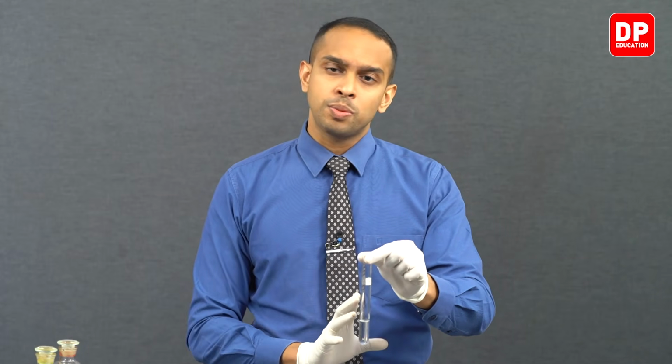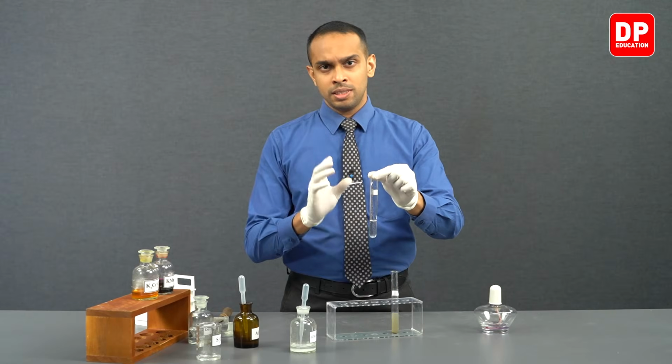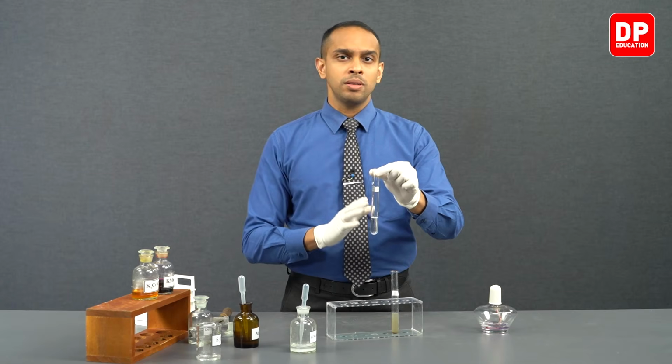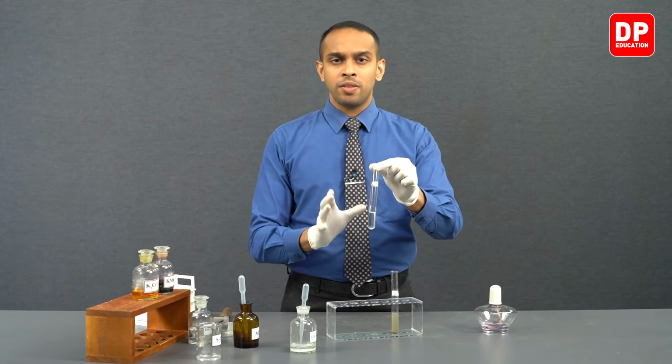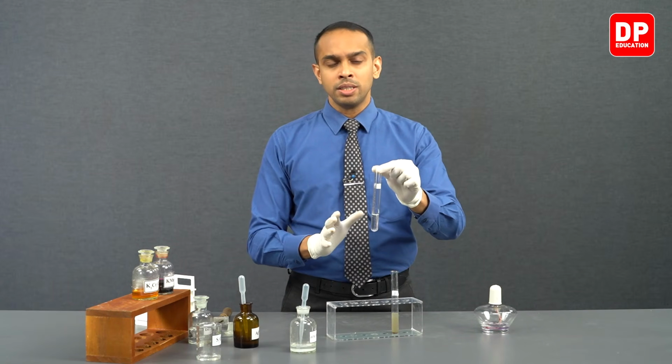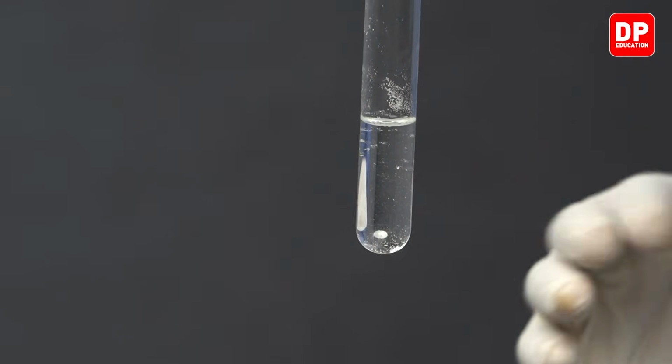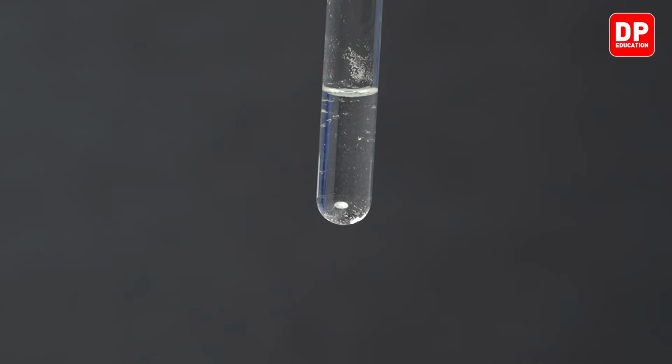However, this precipitate will not immediately turn into a black color. Lead thiosulfate is a stable precipitate. Lead thiosulfate will be white and it will not readily get converted into lead sulfide.